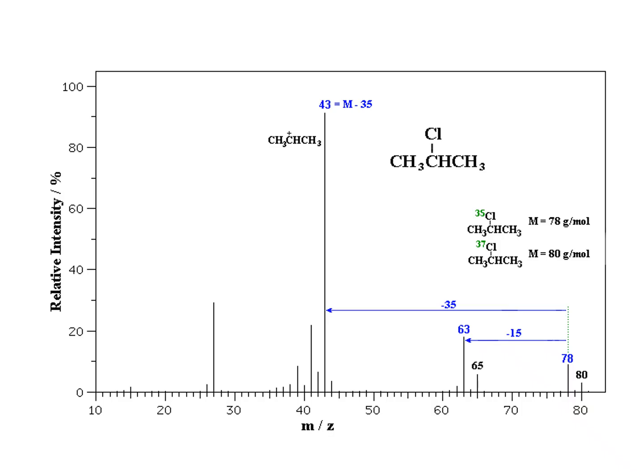If you are asked such a question, you must identify which isotope is giving you which fragment, just as they've done here. They didn't simply draw the chlorine, they identified that it's the chlorine 35 or the chlorine 37. Now, when we look at the chlorine 35 molecular ion at 78, if we lose a fragment of CH3, we find that there's a mass to charge ratio of 63. That CH3 is most likely due to the loss of that methyl group on the left or on the right.